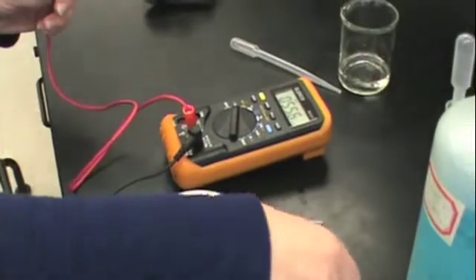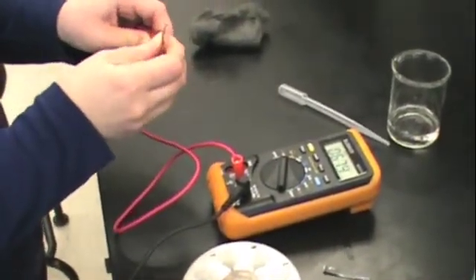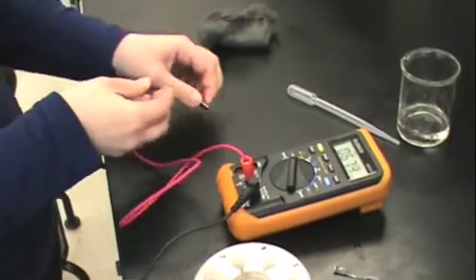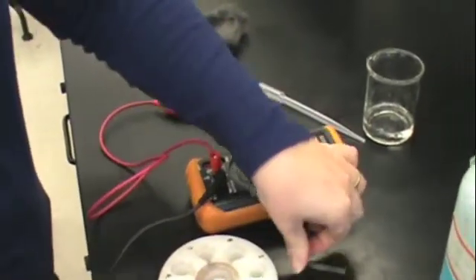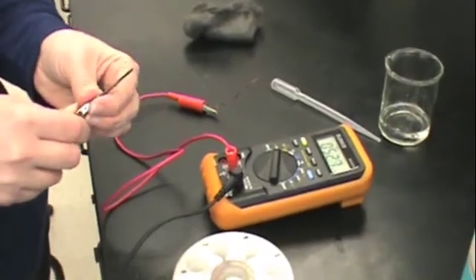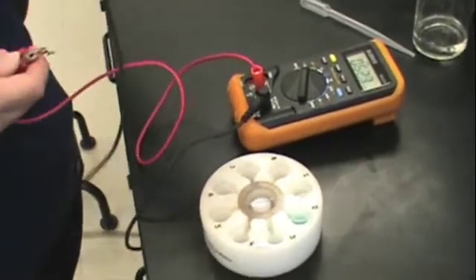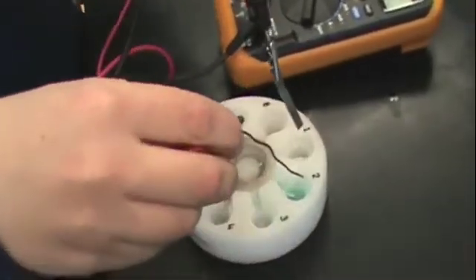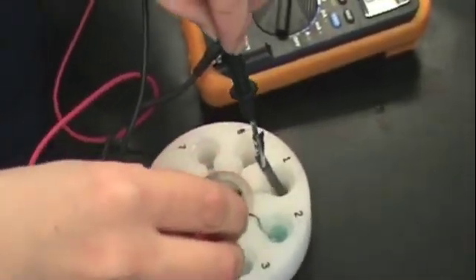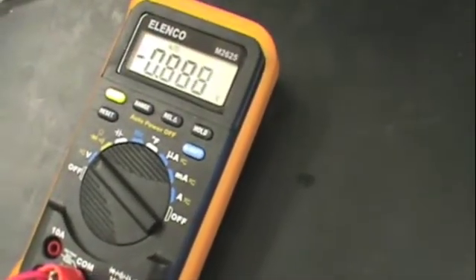Sometimes students reverse their leads and get negative voltages. Make sure that you check your voltage before recording it so that you get an accurate reading. Here we show what happens when the leads are reversed. If you see a negative voltage reading as shown here, you may simply reverse your leads and re-measure your voltage.